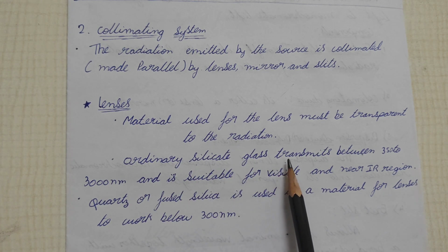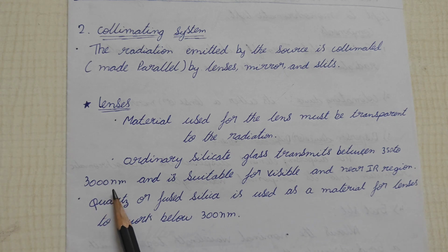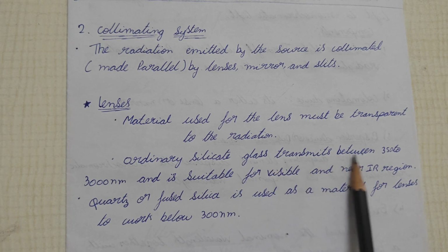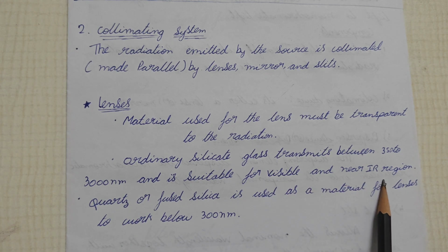Ordinary silicate glass transmits between 350 to 3000 nanometer, and is suitable for visible and near IR regions.